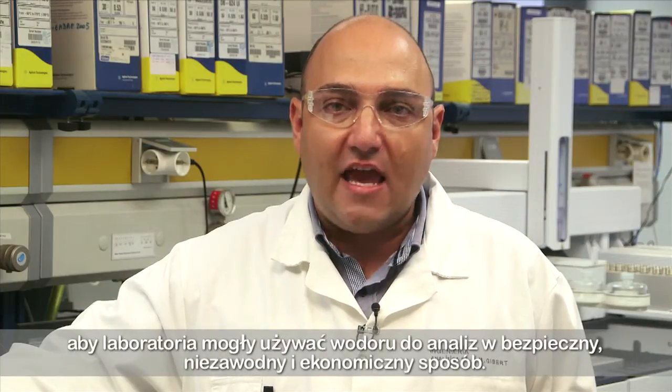Mainly, all new GC and MSD instruments from principal manufacturers are designed nowadays for safe use with hydrogen. Some of these features will be presented later by Dr. Lourdes Vega from MatGas. In summary, the technology is completely ready for the labs to use hydrogen for the analysis in a safe, reliable, and cost-effective way.